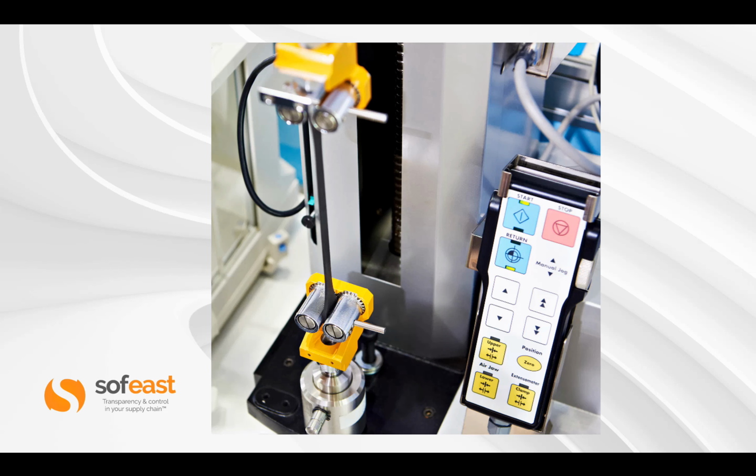Here's a quick image of the UTM in use. We're going to have a look at how to use this and the various different tests during this video.